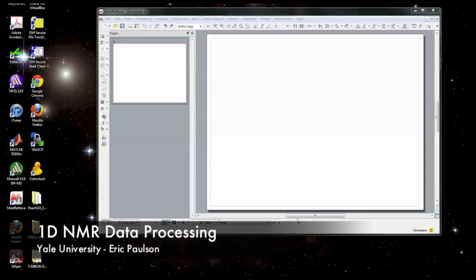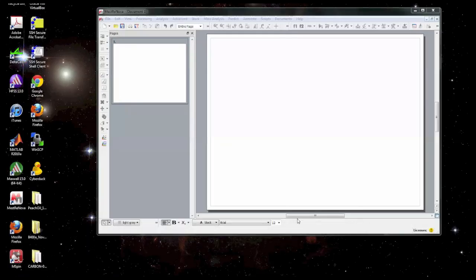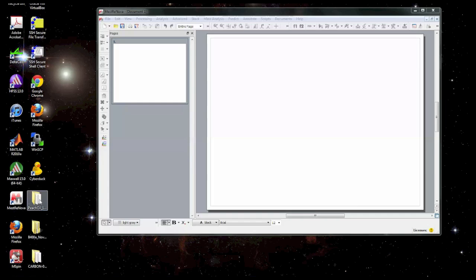In this video I'm going to cover the basics of processing 1D NMR data with Mestronova. In order to do this you already need to have Mestronova installed on your computer and your data transferred onto your computer. There are other videos that cover how to do this.